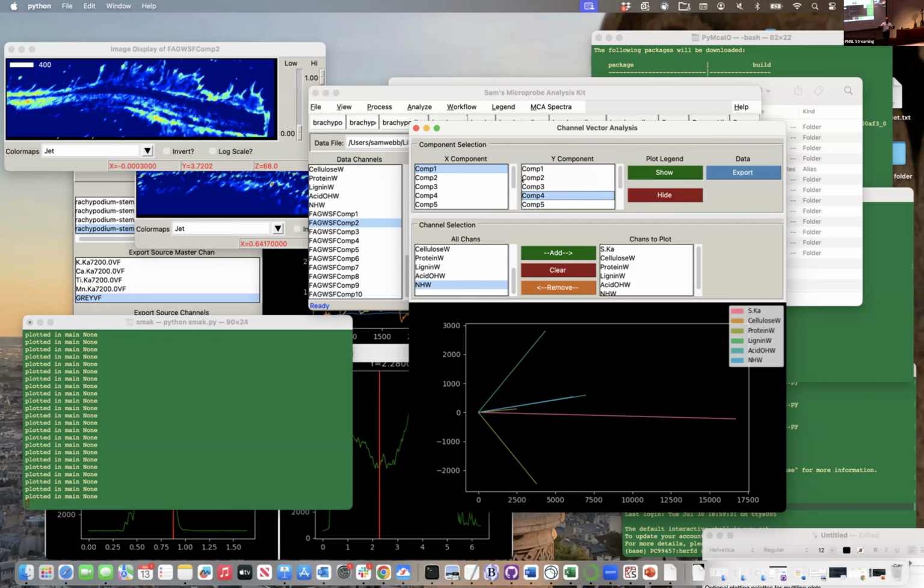And in a perfect world, those images work well together. In an imperfect world, you draw your features and force the manual match. Now it's challenging when we have rad samples that have like 50,000 layers of Kapton on them and everything looks bubbly and the optical images are horrible, right? So that's a new challenge to represent, like we don't have that great bright field image, right?